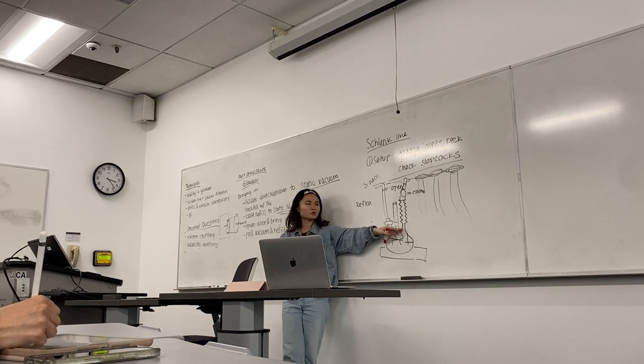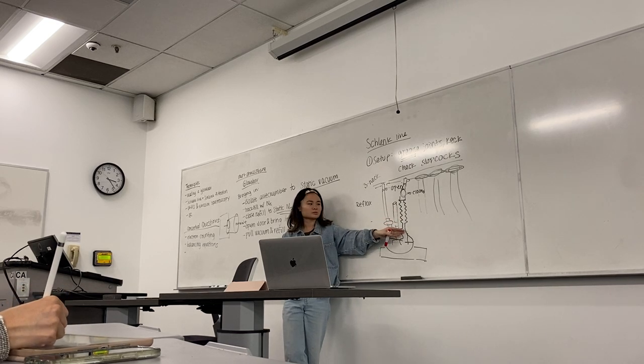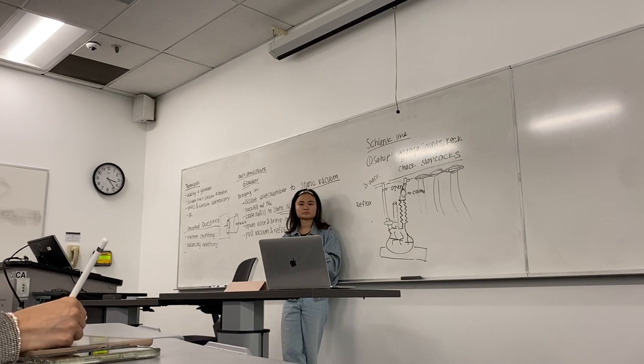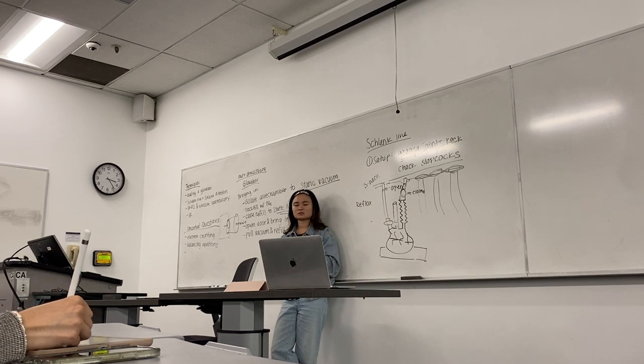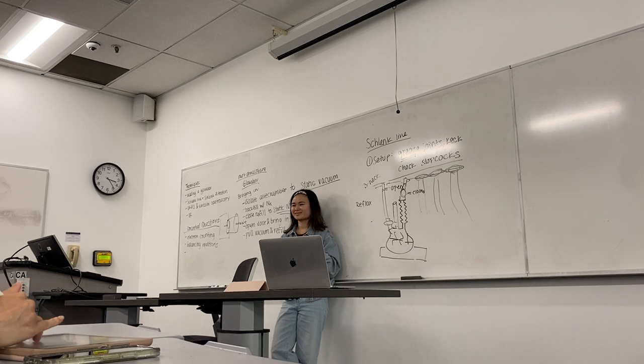You want it to be open to the condenser, closed to the nitrogen inlet, because you want the condenser to be able to catch the vapors. So the condensers should be open to the vacuum? Nitrogen. Look, we're all assuming this is all under nitrogen right now. I should have clarified, there's no vacuum in this. This is assuming that everything's inert right now, and we're setting up a reflux reaction. So the left side is closed, the right side should be open during reflux. Yeah, all under nitrogen. There's no vacuum here.